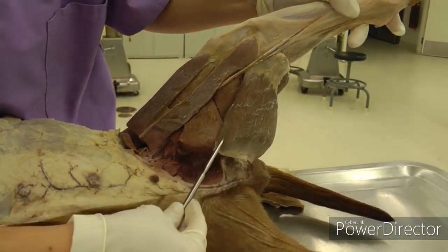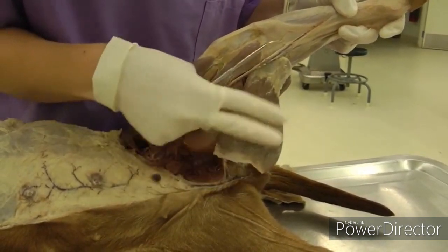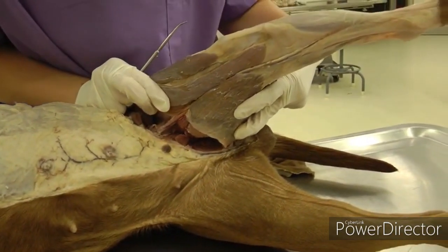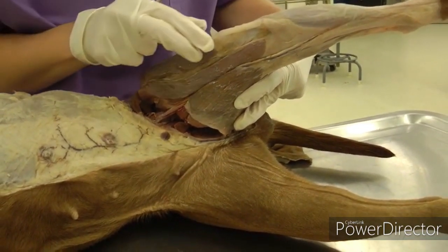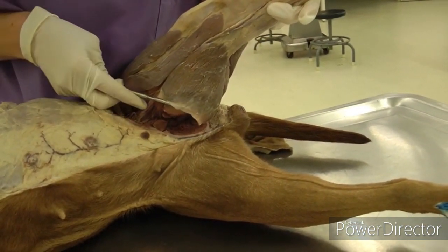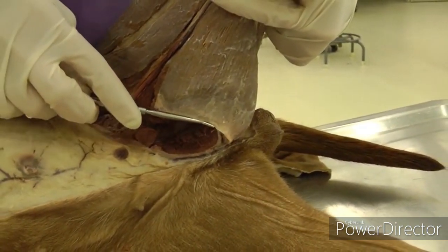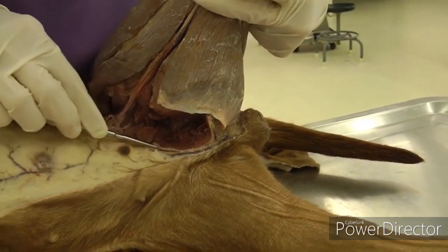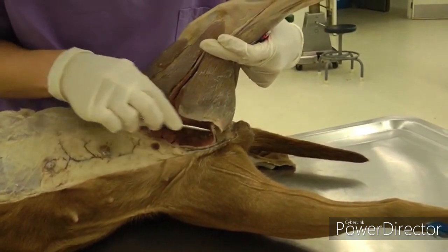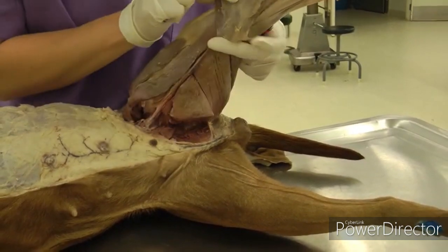Over here we have gracilis — it's a flat muscle that lays over top of the adductor muscle and pectineus. You're going to cut the symphyseal tendon, which you can see right here where the probe is. This fascia is connected to the midline by the symphyseal tendon, so go all the way up to the midline and cut through the aponeurosis and symphyseal tendon to reflect gracilis distally.